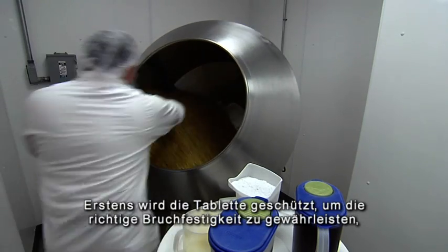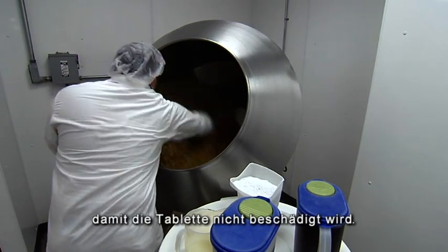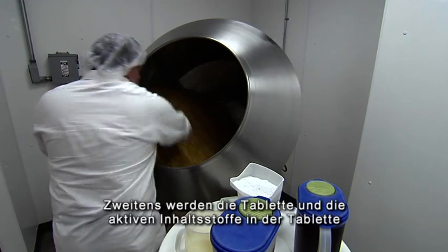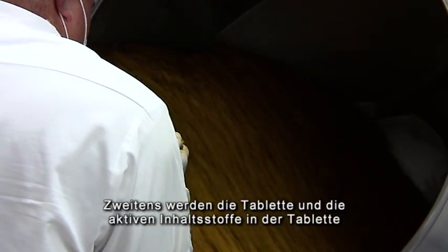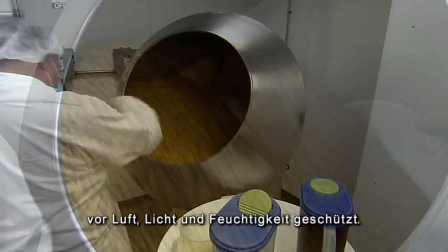The first thing it does is help protect the tablet and ensure the friability of the tablet — the ruggedness — protecting the tablet from physical damage. The second thing it does is keep the tablets and the active ingredients in the tablets from being exposed to either air, light, or moisture.